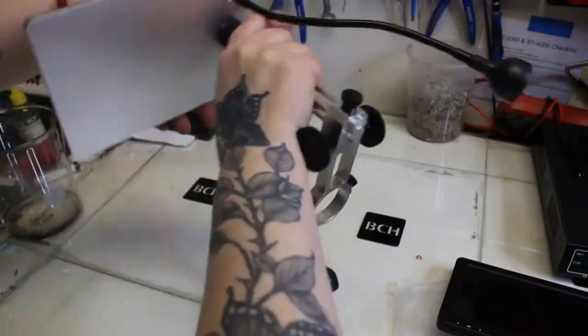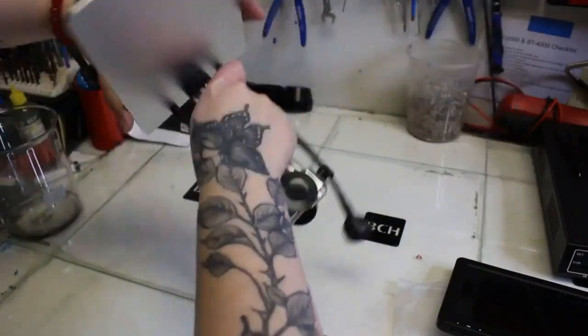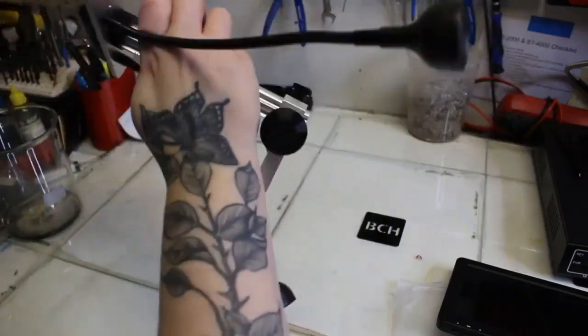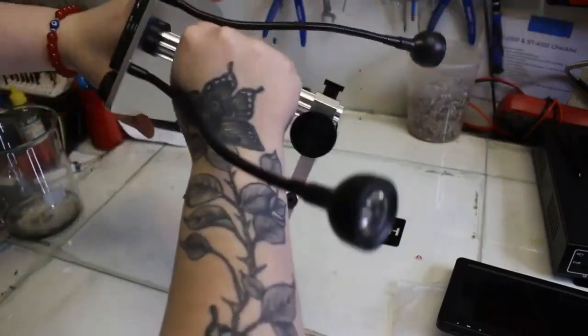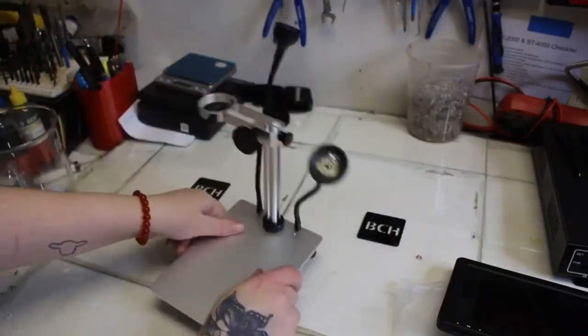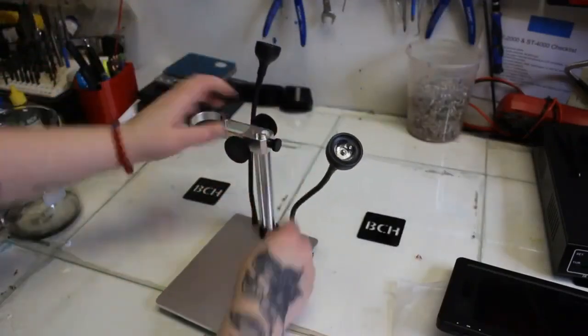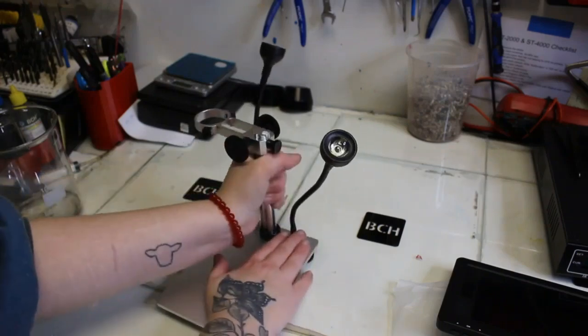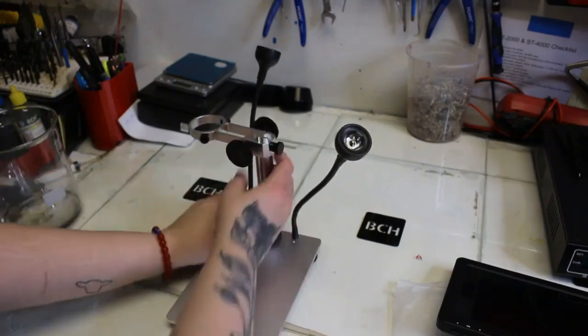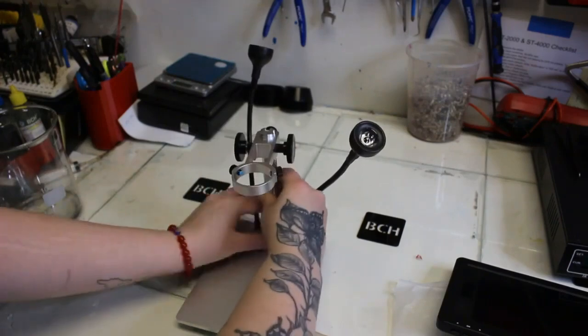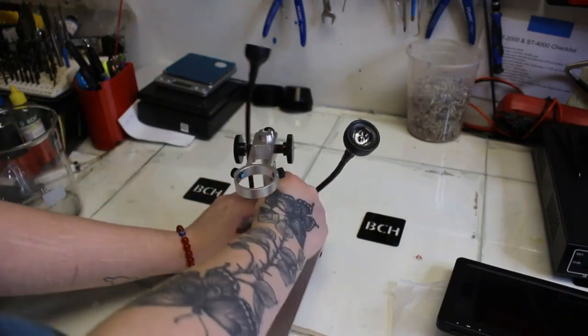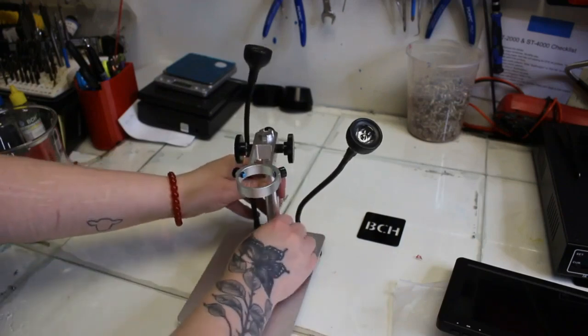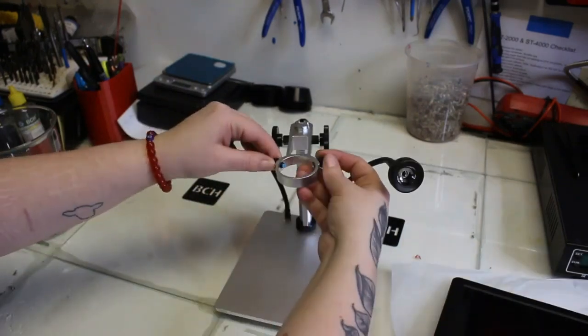First thing was to put the arm stand onto the base. For me I found it a lot easier to actually hold it upside down and screw the base onto the arm rather than the arm onto the base. Maybe it's because I really needed the arm to stand up straight. It was difficult for me to do that but I got it in there and you will too.